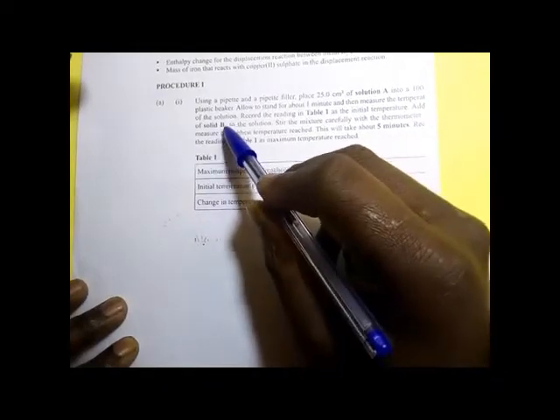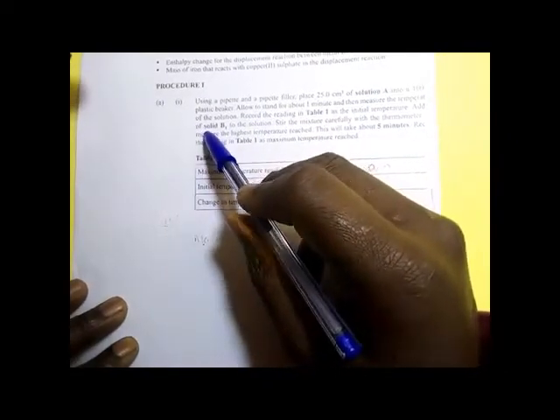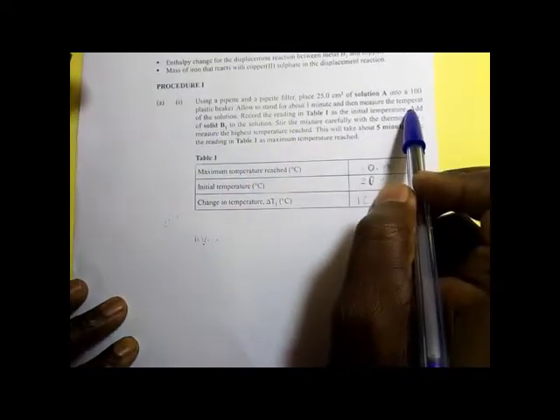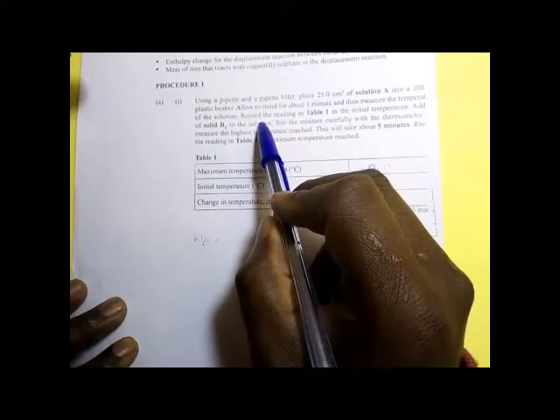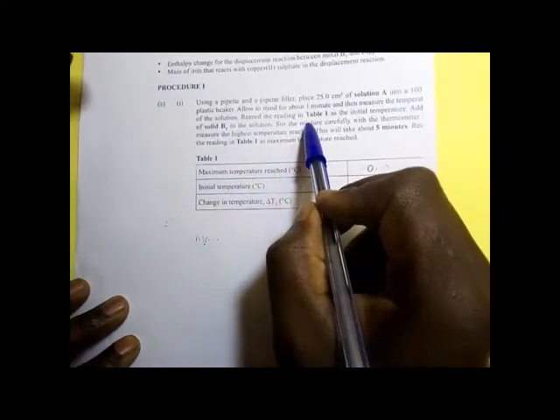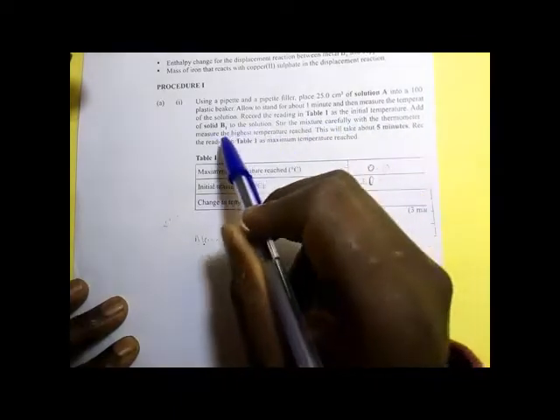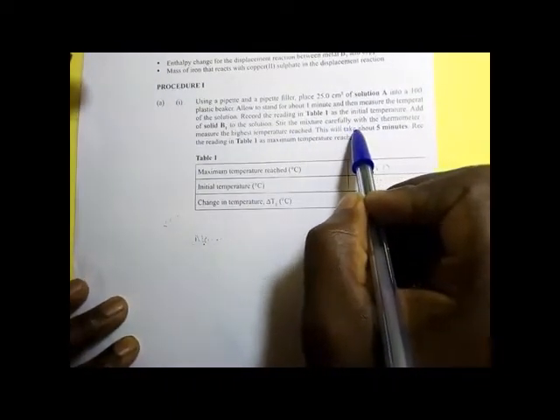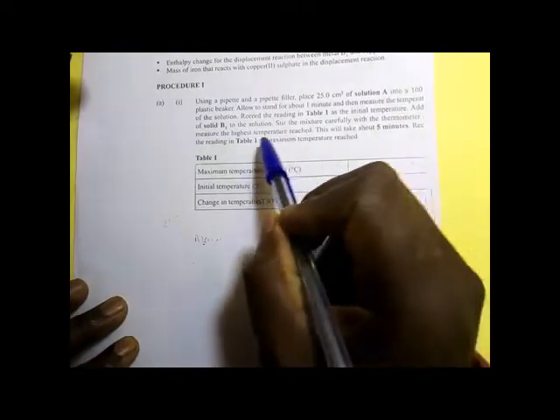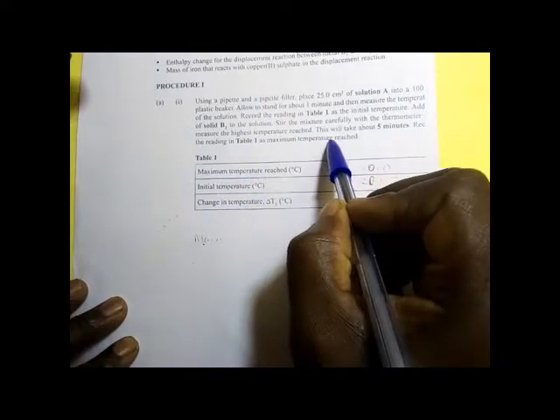Add solid B1 to the solution. Start stirring the mixture carefully with the thermometer. Measure the highest temperature reached. This will take about 5 minutes. Record the reading in table 1 as the maximum temperature reached.